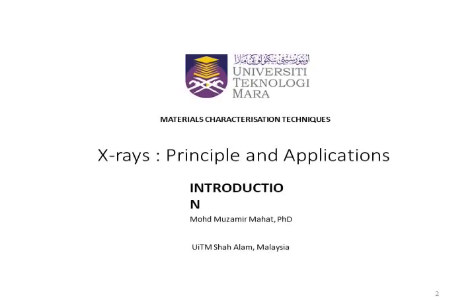Today's lecture we are going to discuss material characterization techniques, focusing on X-rays, principle and application.